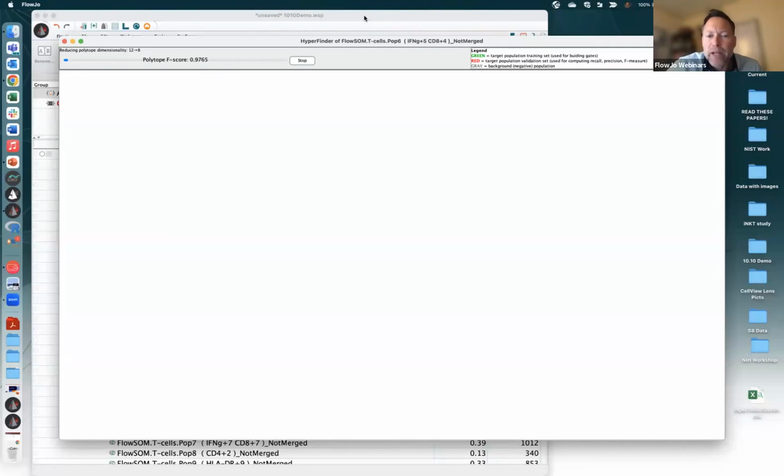Is MEM score a non-user bias way of merging than cluster explorer you merged earlier? Yeah, good question, and you are absolutely correct. Whereas when I picked the green cluster and the red cluster, I was like, well, they look kind of next to each other. I'm going to merge them. I had the ability to look at a line plot, and I could see for each parameter, was there a parameter that those two clusters had some differential expression? And in fact, we saw it. It was the HLADR parameter, looked very different. And I merged them anyway. So user bias was totally in play right there.